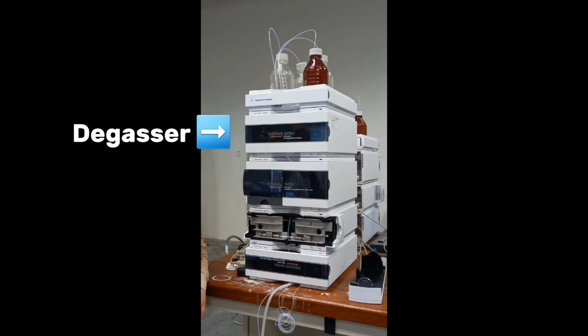monitor. In addition, a degasser in HPLC with RID is used to remove dissolved gases from the mobile phase. This helps maintain a stable and reliable baseline signal in the RID, improving the detector sensitivity and accuracy in detecting compounds in the chromatographic analysis. The removal of gases prevents fluctuation in the refractive index baseline, ensuring precise and consistent measurements of sample concentration during the separation process.